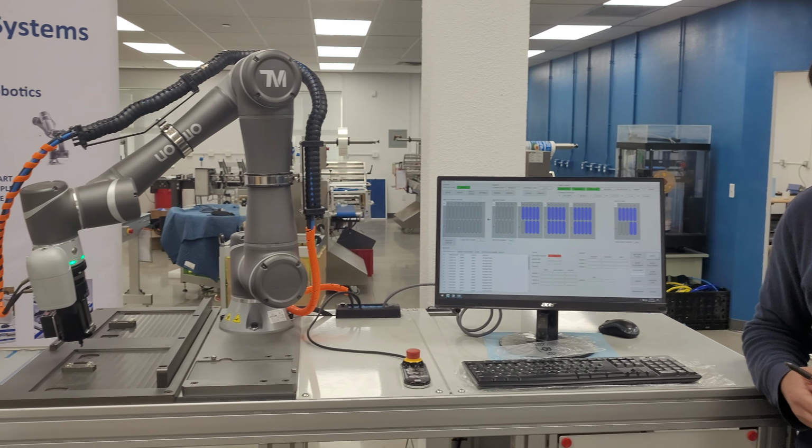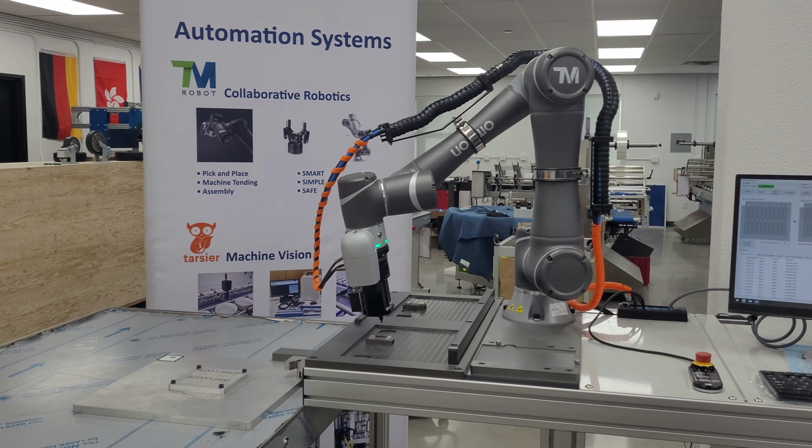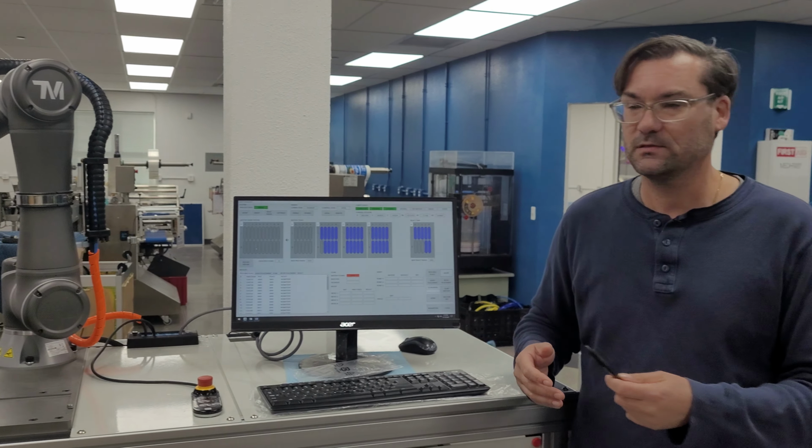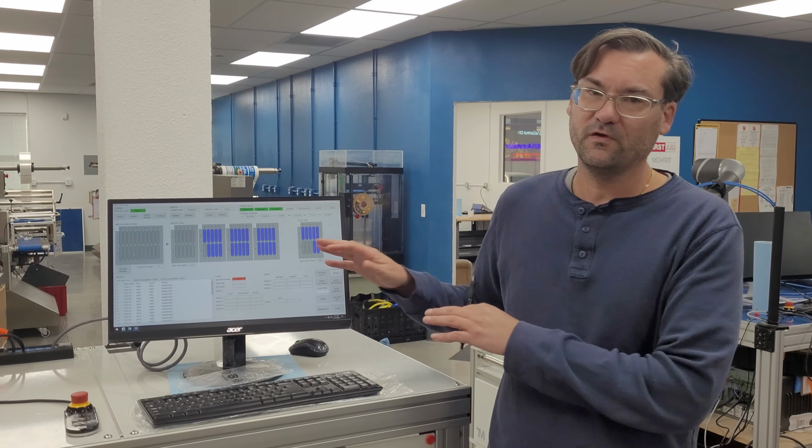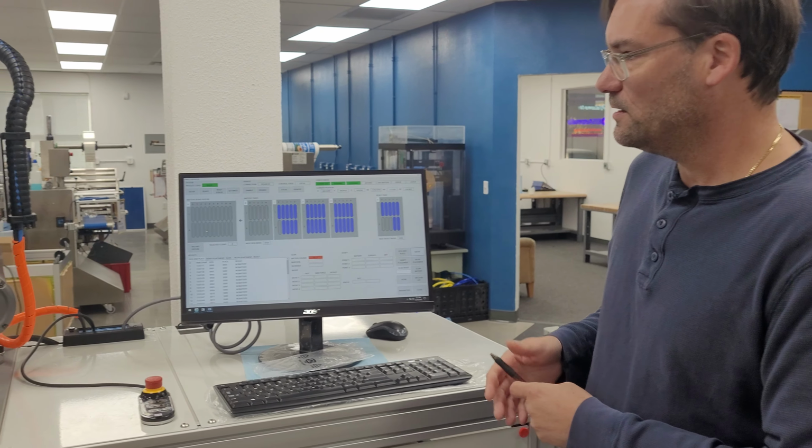Today we're making another video about collaborative robotics. What you see here is a collaborative robot workstation that will be implemented in a lab environment. Our focus is on robotic workstations as well as complete robotic work cells. And today's video is not so much about the hardware of things. We've covered that in past videos. Today's focus is on the software side of things and how we can drive a system like this.